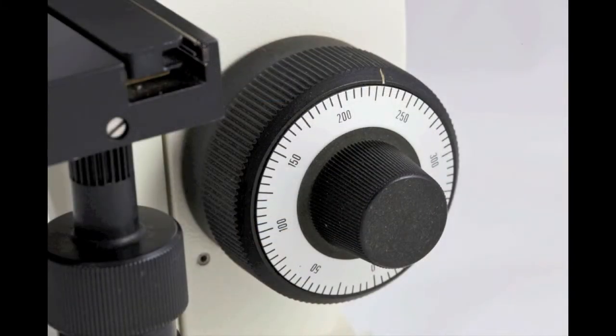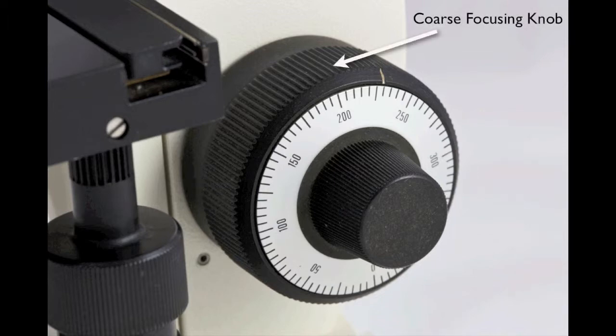Focusing is accomplished by two knobs, which are located on the arm. The outermost knurled ring is the coarse focusing knob. Turning this knob will move the stage up or down rather rapidly, which is appropriate when using the scanning or low-power objectives.